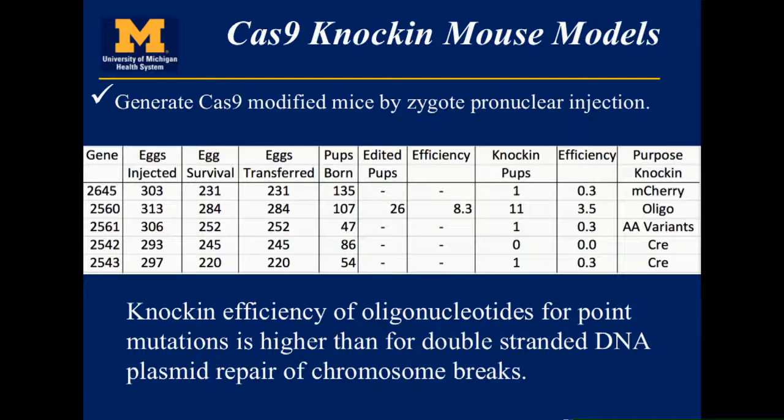And here are the knock-ins. So the oligonucleotide knock-ins, this is one example. We've done a number of these. The efficiency is basically the same as for a standard indel. But once you go to put in a knock-in, then it's less efficient.